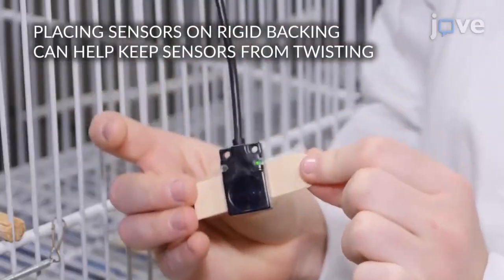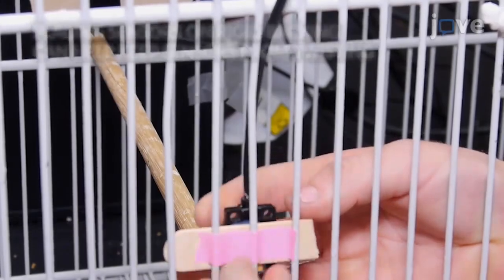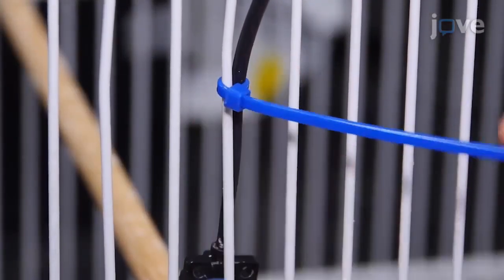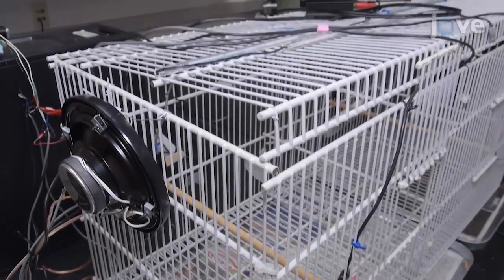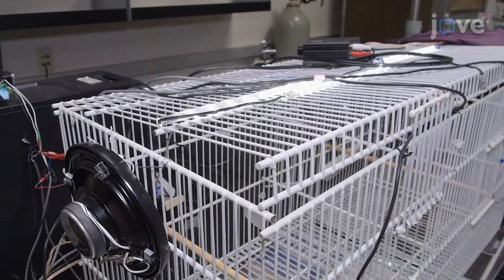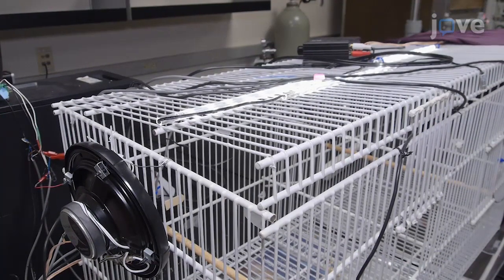Use zip ties to tether the emitter and receiver of the photoelectric sensor on the cage directly above each end of the perch. Place under-cabinet LED lights on the top of the cage to provide enough illumination that the animals will move freely between the two side chambers.